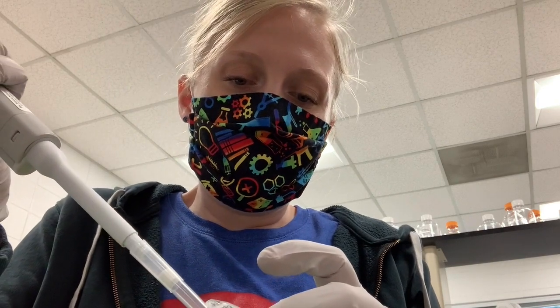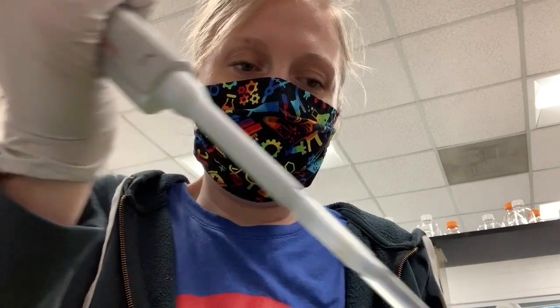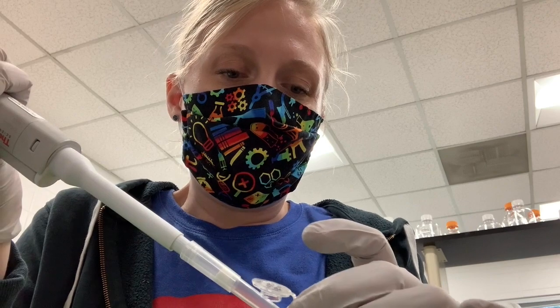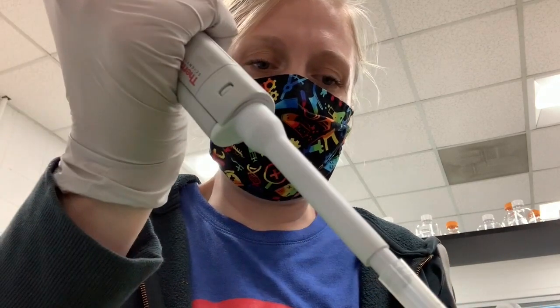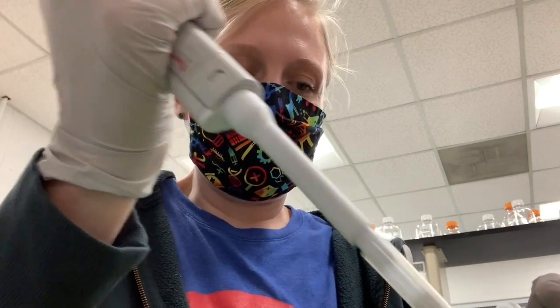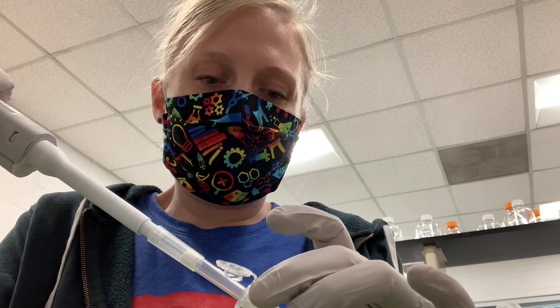I think that often these pellets will appear to be kind of clear or glassy. They're kind of gooey, sort of like a gel-like consistency if you accidentally try to pipette one up. Occasionally they will instead be kind of white and chalky, and we found that for the most part there's no difference in the quality of that double-stranded RNA or the ability to induce knockdown of genes. So this may have something to do with the buffer conditions just varying, or other reaction conditions slightly varying, and you get a different pellet. Anecdotally, I always am happier when I get a glassy pellet, but I don't think it really matters too much. We've had success with both types. It's reassuring when you get these pellets, I would say.